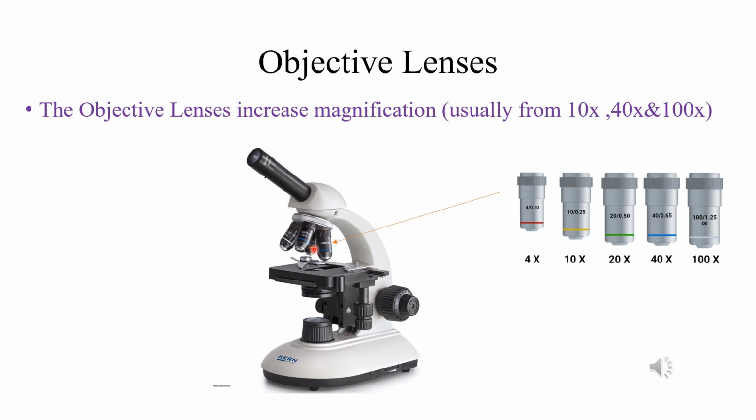In a compound microscope, we use different types of objective lens depending upon the magnification we need. And in this microscope we use 4x, 10x, 20x, 40x, and 100x. And this objective lens is present in the nose piece. And by rotating the nose piece, we can change the magnification of the objective lens.